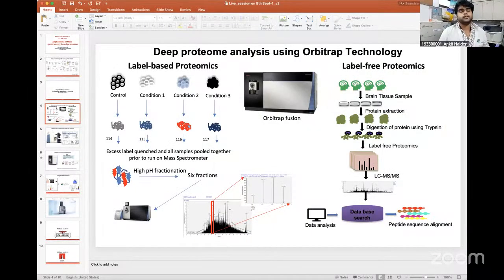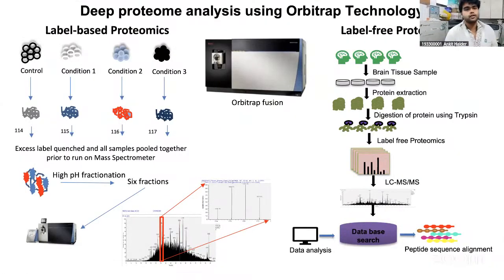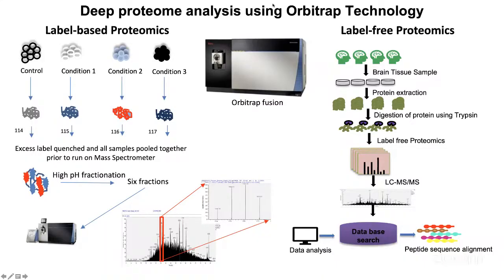So that's how, starting from Bradford quantification, you can see the amount of protein, and after using trypsin and following some of the steps, you can also see how much peptide is there. Based on the peptide concentration, you can put the samples into the mass spec and go for any kind of global proteomics acquisition. So this is for the in-solution digestion and peptide quantification. Okay, now I think the samples are ready, so we can take the sample and proceed for the mass spec analysis.